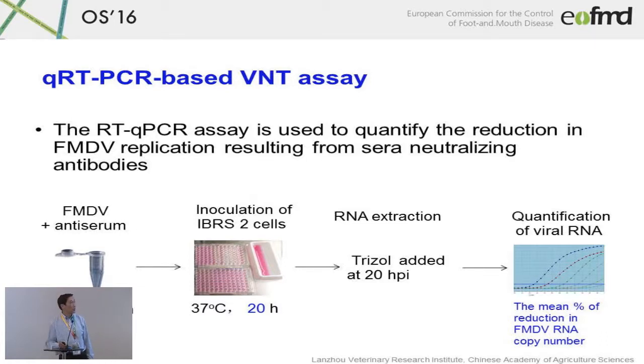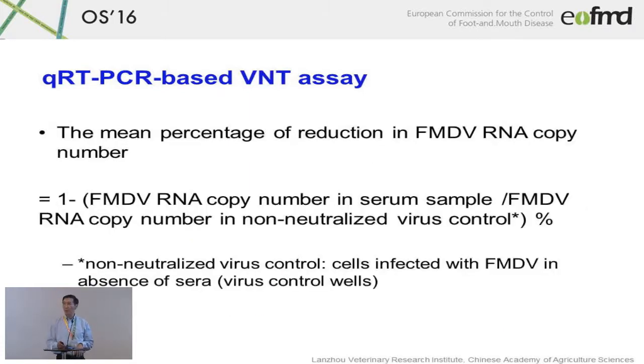Of course, to see the difference in terms of reduction of virus replication in the sample compared to the virus control, we need to do some calculations.